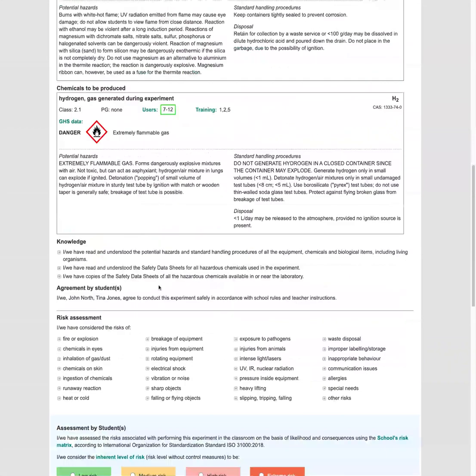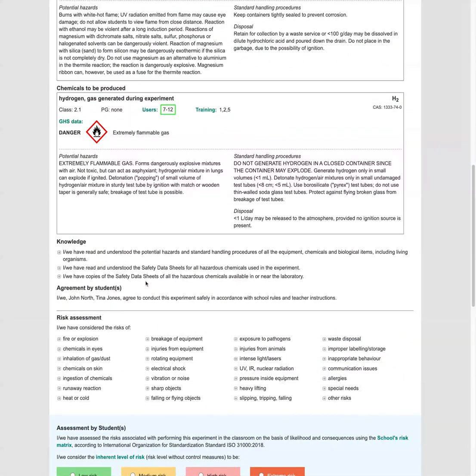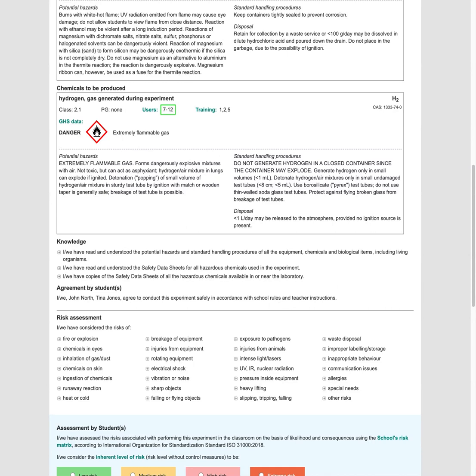So we go ahead and have a look at the knowledge section. So we're saying that we've understood the information above and we've got safety data sheets available and we're going to conduct this experiment on school rules and teacher instructions.